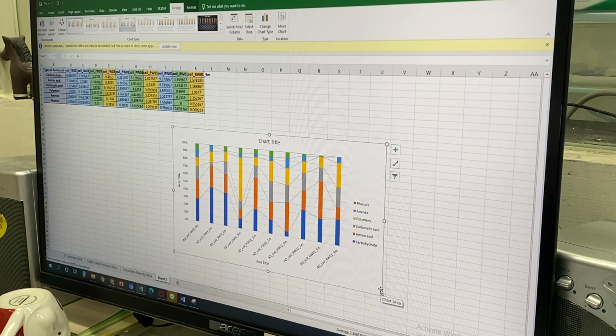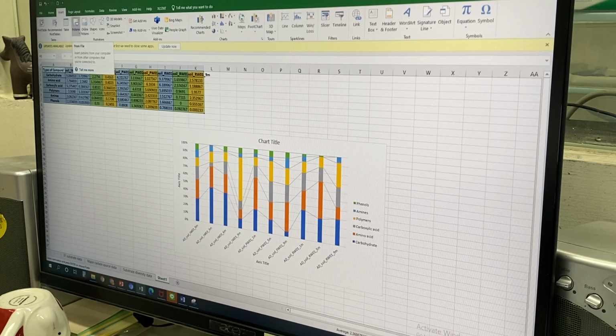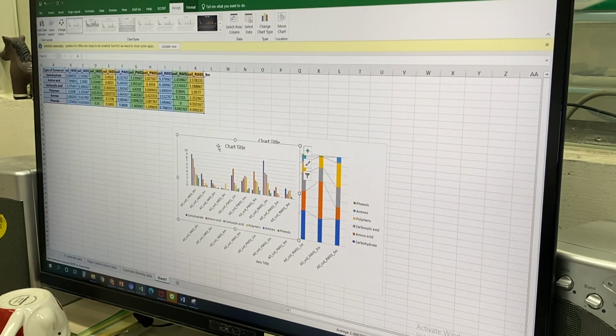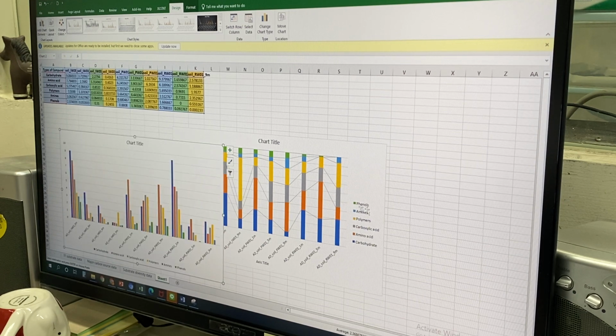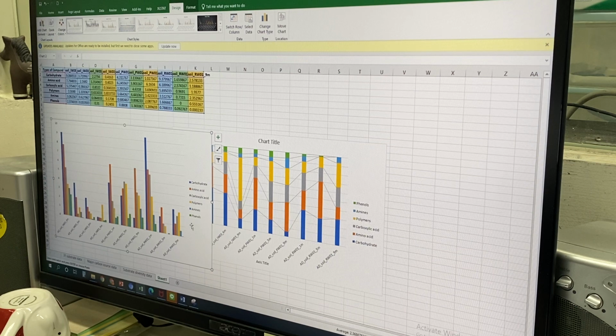Maybe in the end I can ask you about this. Or you can do this one. So whatever you like, you can do. So this is also a very good example. So you can do like this one. Just go and change some plot.